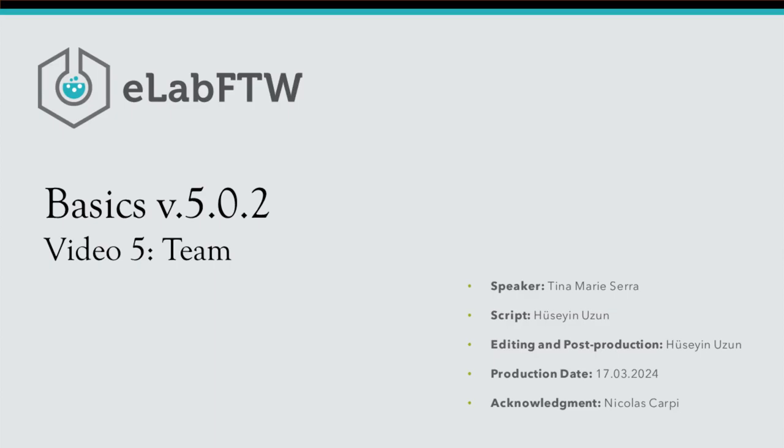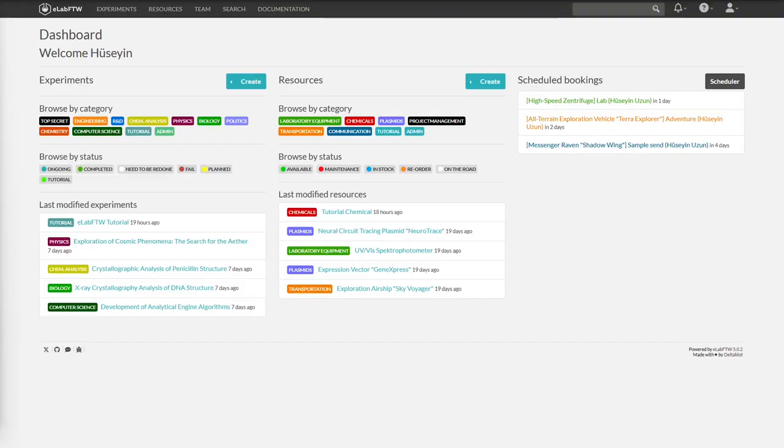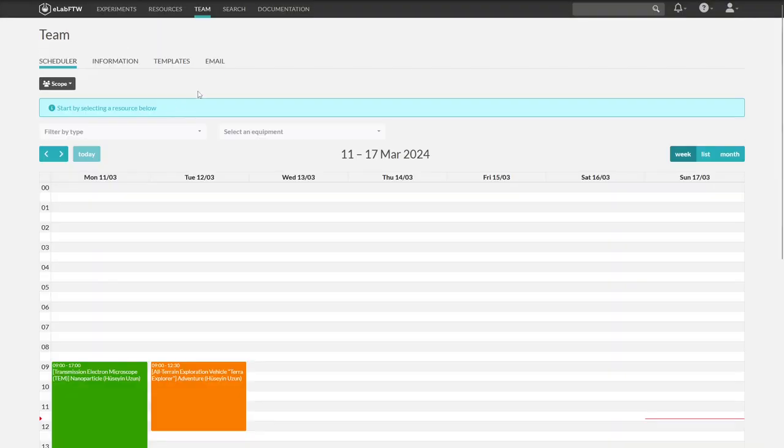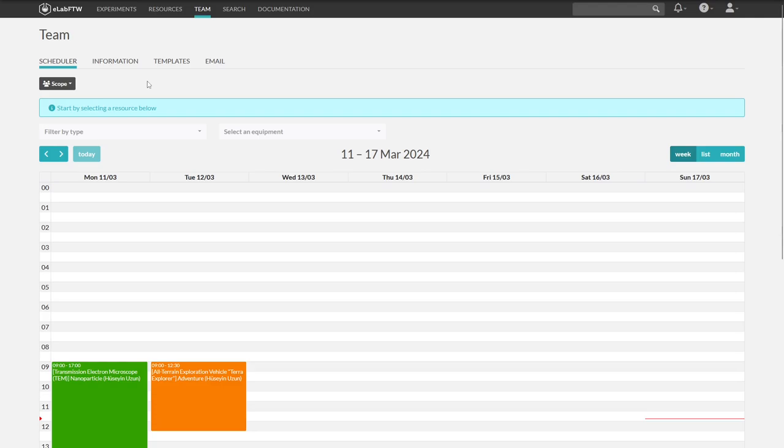Welcome everyone. In this video we will check out the team page. Let's go to the team page. The first thing we see is the scheduler. But the calendar is only visible if there are bookable resources.